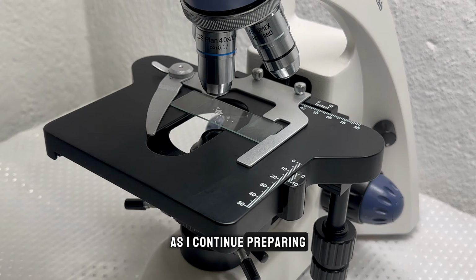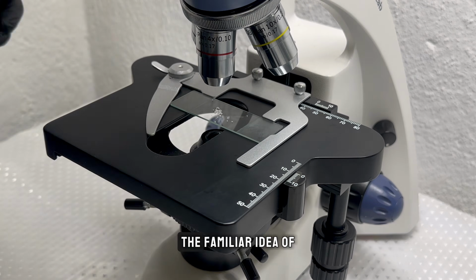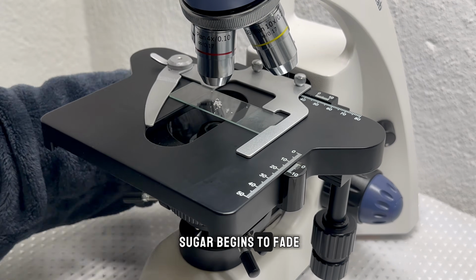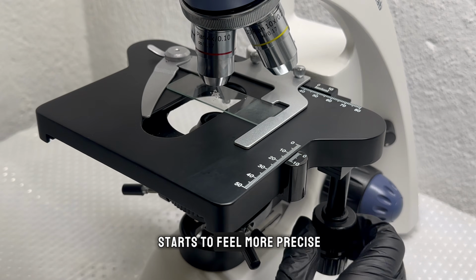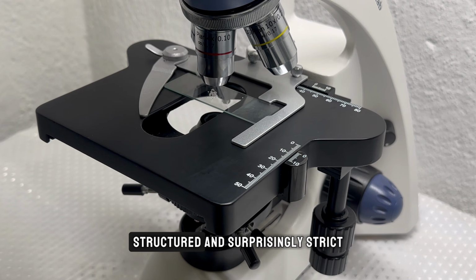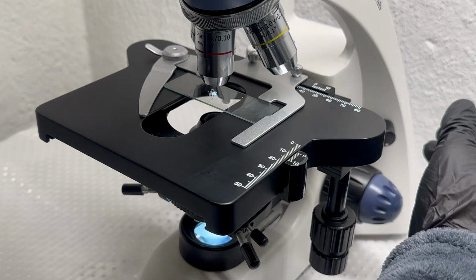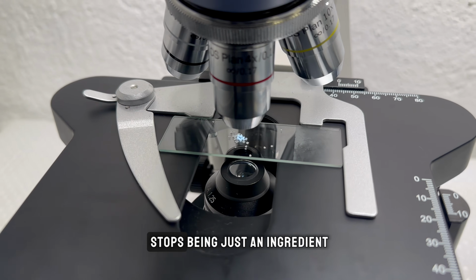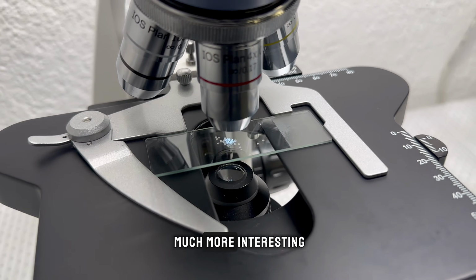As I continue preparing the sample and get ready to increase the magnification, the familiar idea of sugar begins to fade. What once felt ordinary starts to feel more precise, structured, and surprisingly strict in its form. This is where sugar stops being just an ingredient and starts becoming something much more interesting.